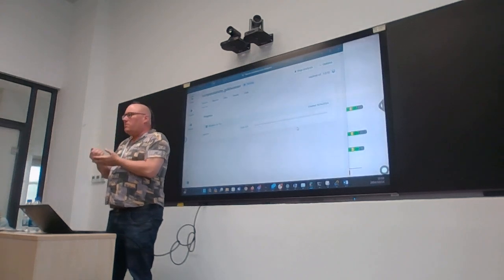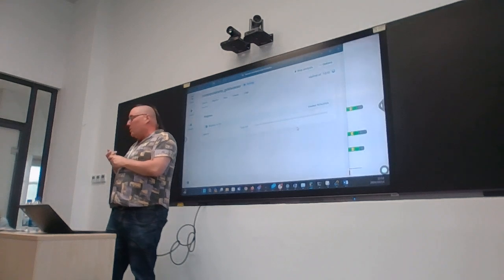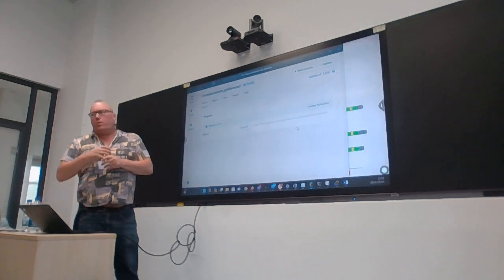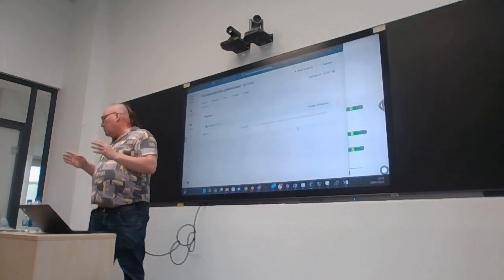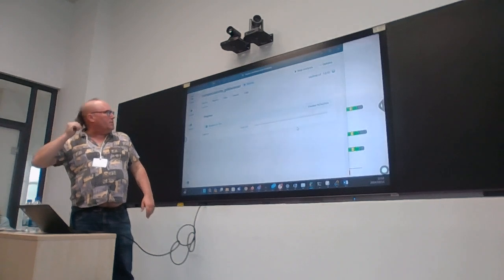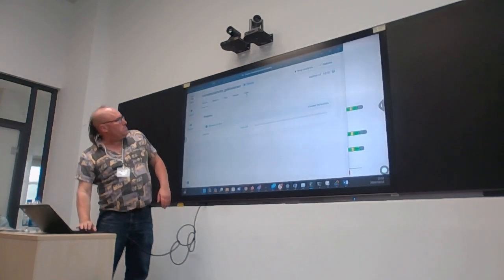It masks them out, and then if you select the background option, it shows you your sequence in the context of other sequences that exist out there. I will show you that if this runs successfully. Just check the log screen.